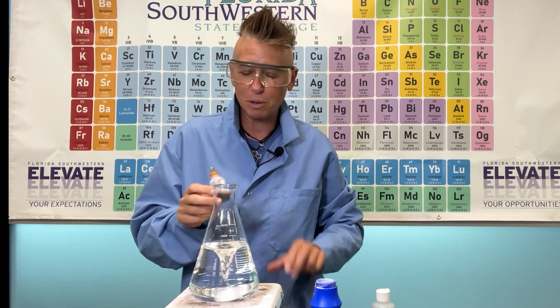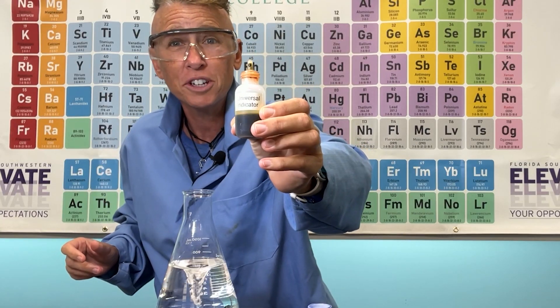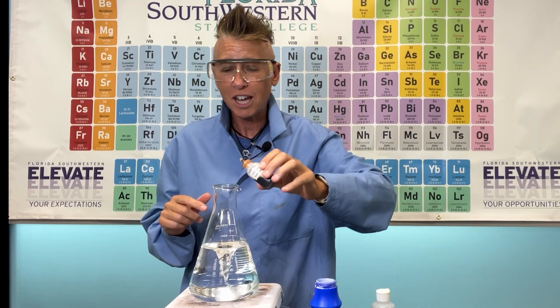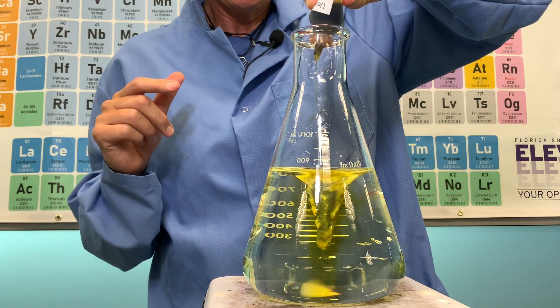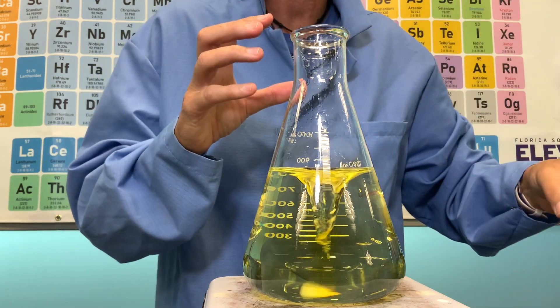For this experiment I'm going to use a universal indicator. Putting the universal indicator into some water — a universal indicator is a mixture of several different compounds that change color at different pH levels.